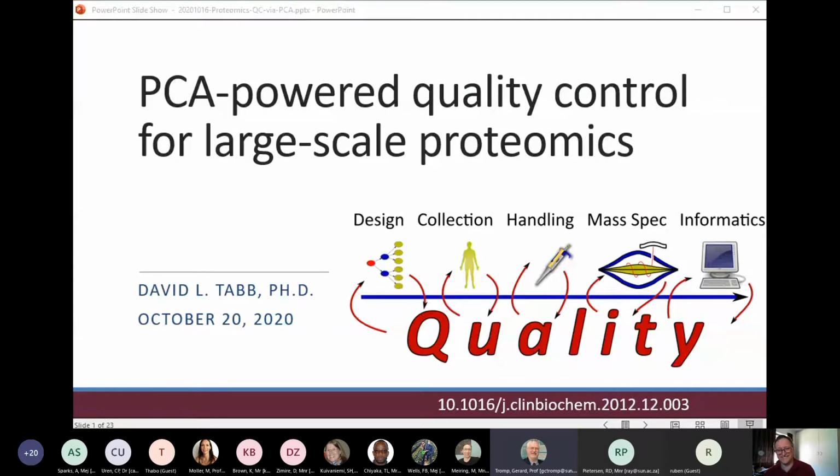And he there worked on a lot of software. I'm not going to mention all of them, but they're all to do with mass spectrometry and using data from mass spectrometry efficiently. One is called ProteoWizard, which is still used extensively. Another one is ID Picker, and some of the work here sort of extends on that basis of the software that he developed there.